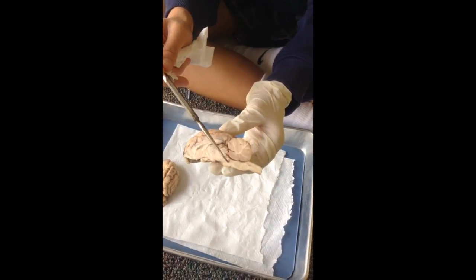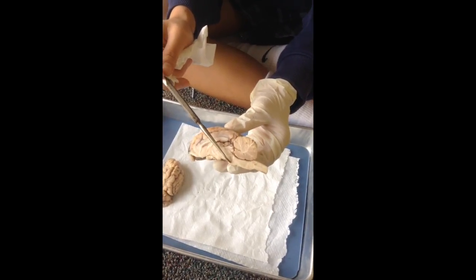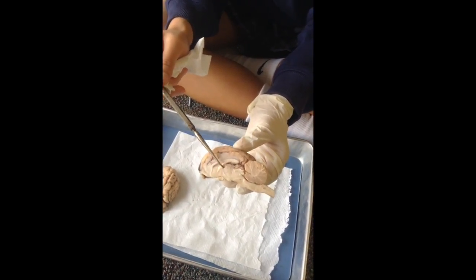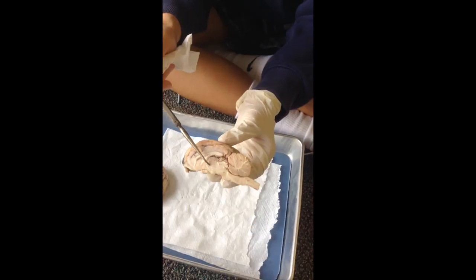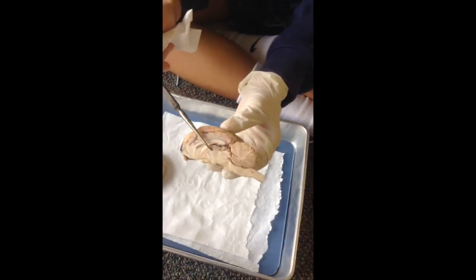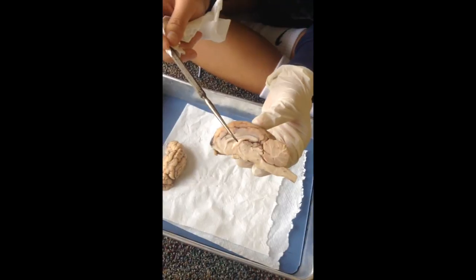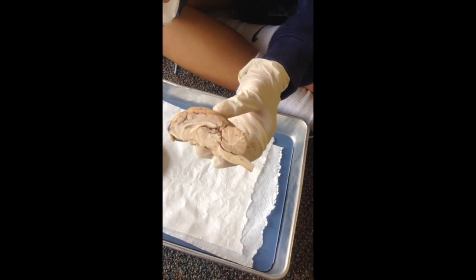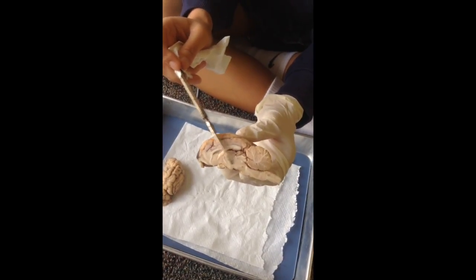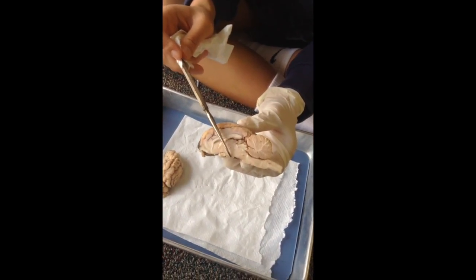Pons. It's the part of the brain that works with the cerebellum in coordinating voluntary movement. The thalamus is the brain sensory switchboard located at the top of the brainstem. It directs messages to the sensory receiving areas in the cortex and transmits replies to the cerebellum and medulla. Mammillary body. It's where smell and memory are located in the hypothalamus under the pituitary gland.